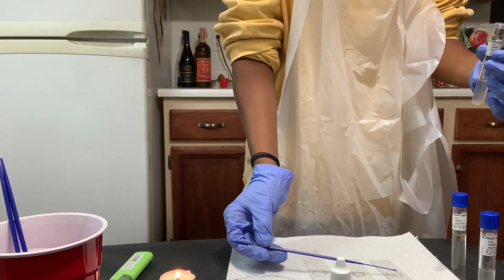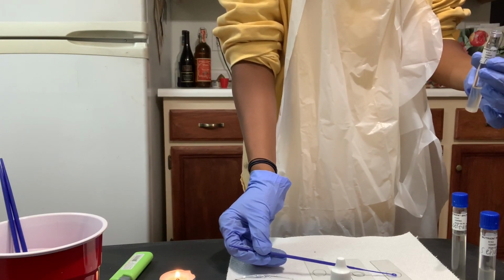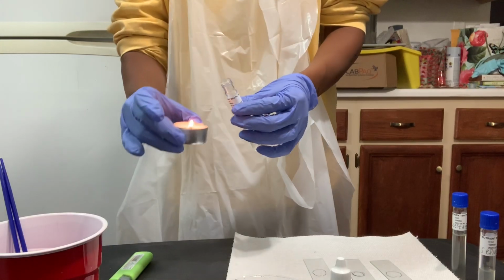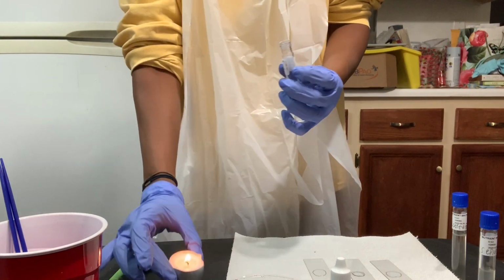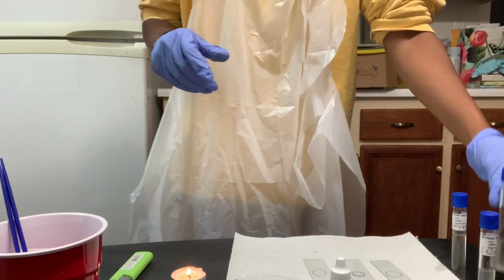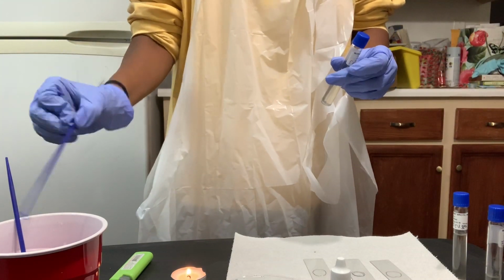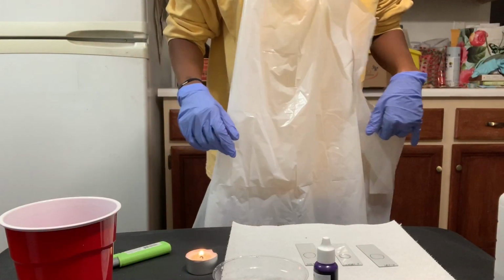Next, I am going to slide the loop all in the dime-shaped circle of our slide and put my inoculation loop in bleach. Again, I'm going to sterilize that lid part and replace the top. While that is drying, I'm going to continue to S. epidermidis. So again, I'm going to take my loop and continue the same procedure.